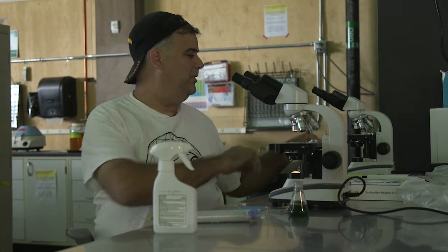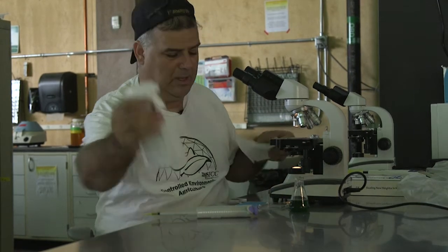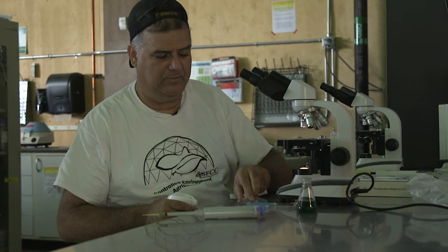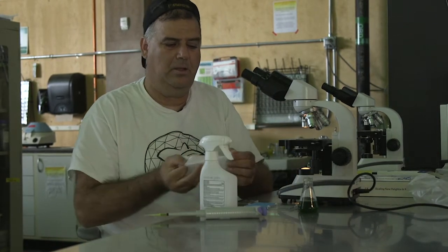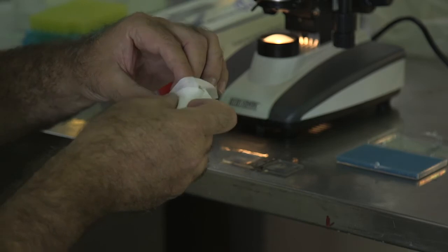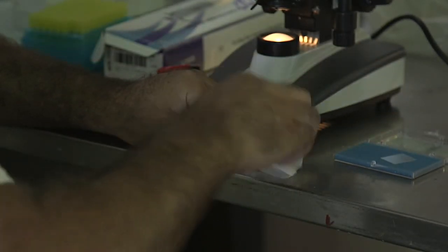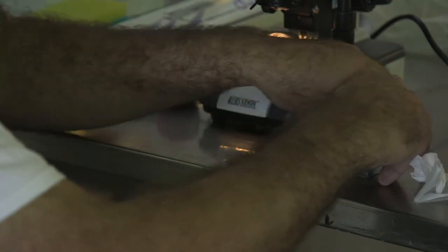You can clean up the slide using lint-free paper and some alcohol. Take off the cover slip, spray it with alcohol, dry them off, and put them back in their case.